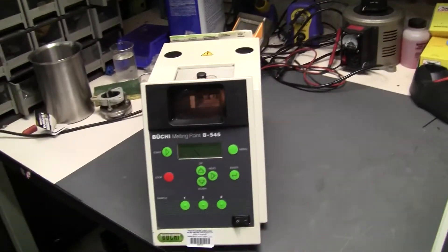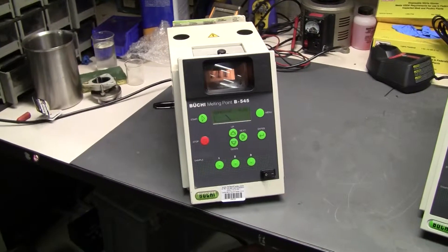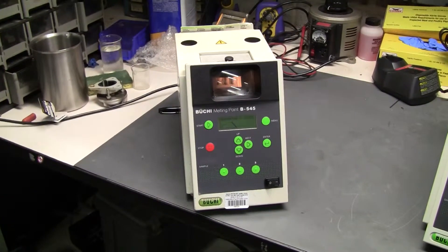Hi, this is Michael from HitechTrader. Today we're looking at a Büchi Melting Point Apparatus, model number B545.